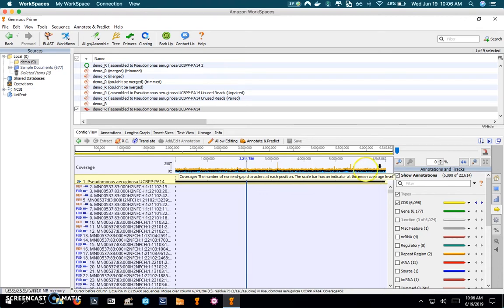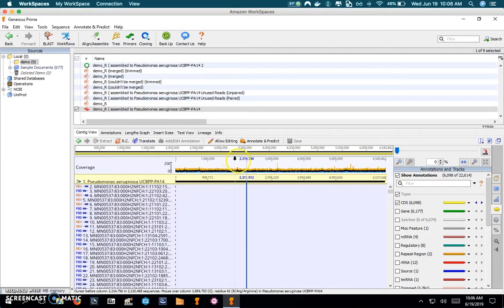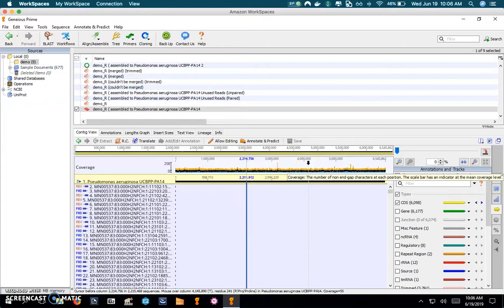In this case I think the coverage was about 52x roughly with a small standard deviation, and so it's nice uniform coverage all the way across the genome and that's always a very good sign. If the coverage is too low we would probably see a number of artificial gaps in here. We don't want to see those.